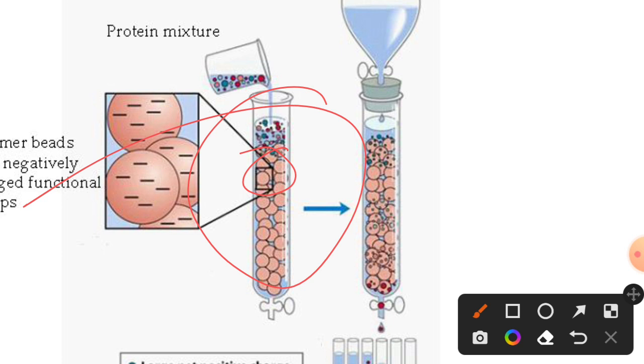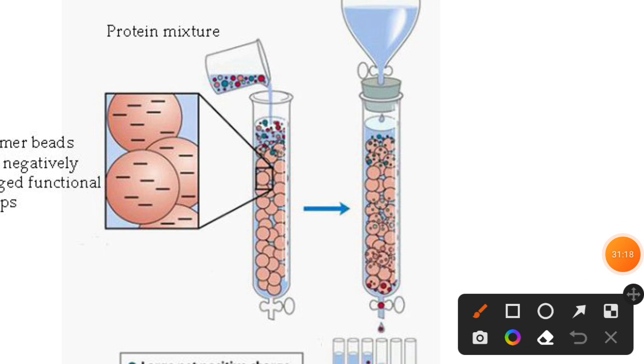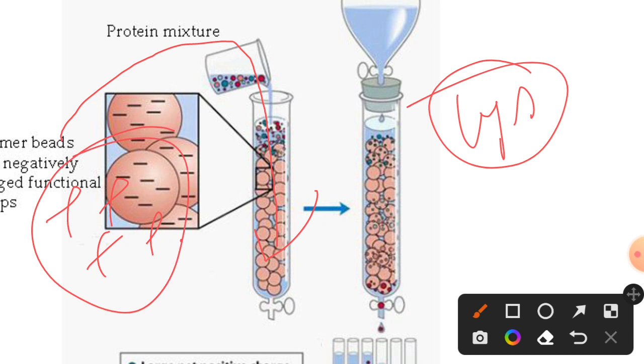No. After the separation we will use an elution buffer that obviously contains a more positively charged compound than lysine. As a result, lysine will lose the competition with those positively charged compounds and it will be separated. That's how the entire ion exchange chromatography works.